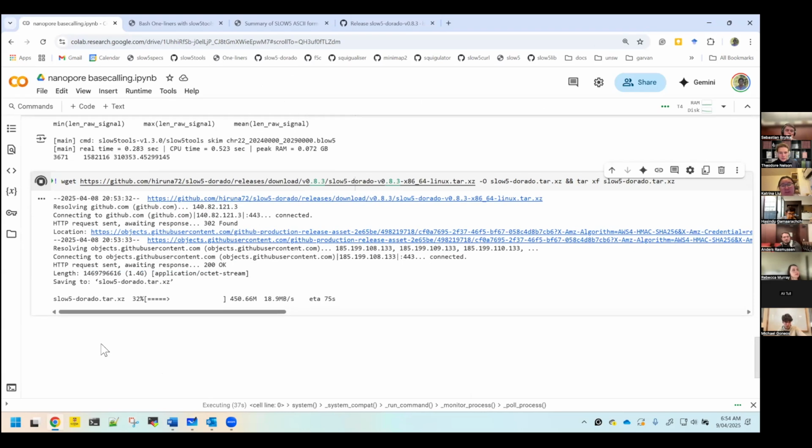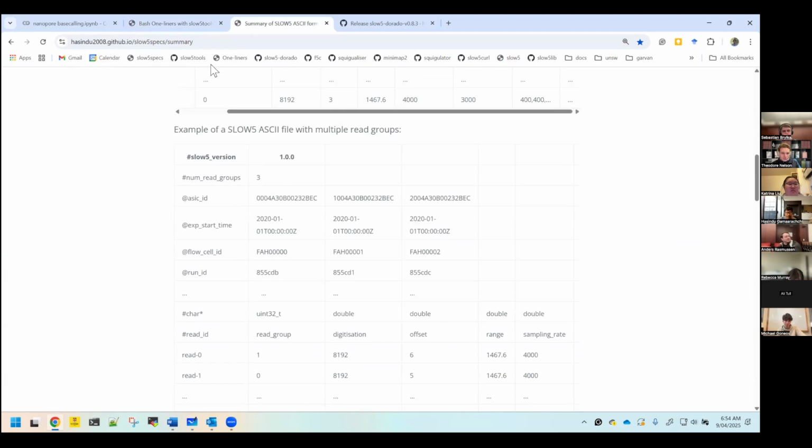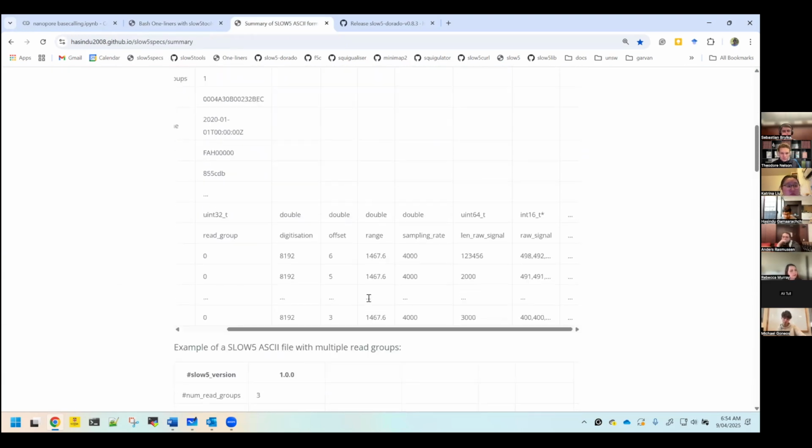Can you maybe provide a little bit of insight into the conversion between the picoamp signal and the signal that's reported, and the reason for that? Yeah. So let me again go into that equation. These sequencers internally, connected to the nanopore, have something called the analog to digital converter.